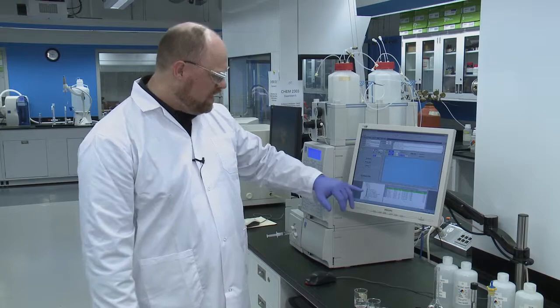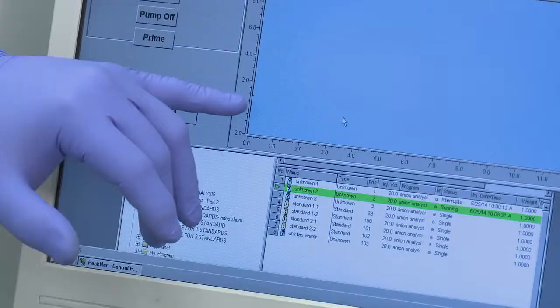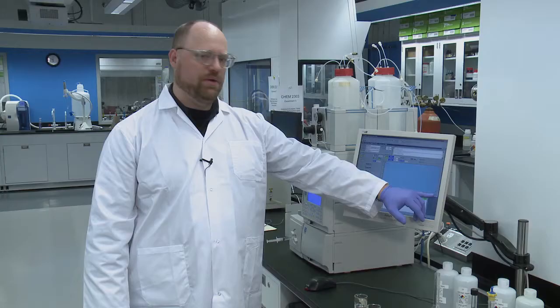Close that window. And then what you can see now is a trace starting on the screen. And you're going to wait in the time scale on the screen as well. And you're going to wait until that time scale reaches about half a minute.